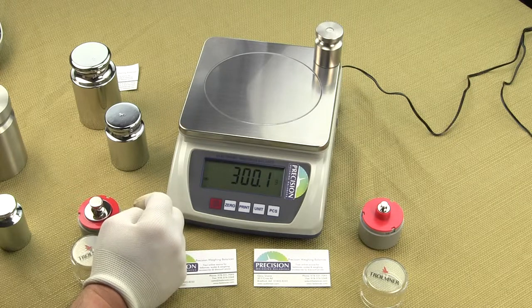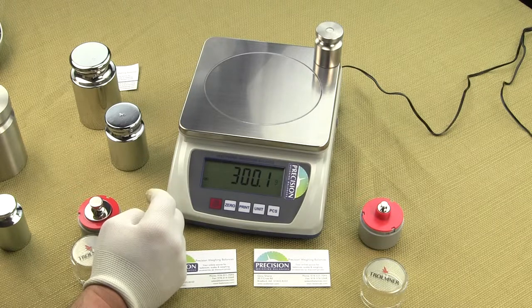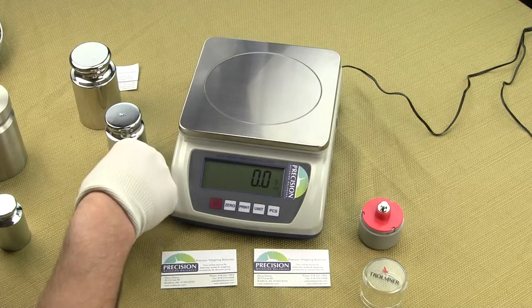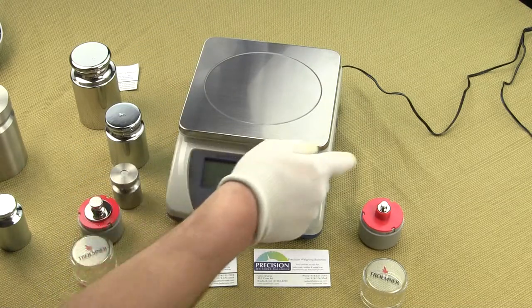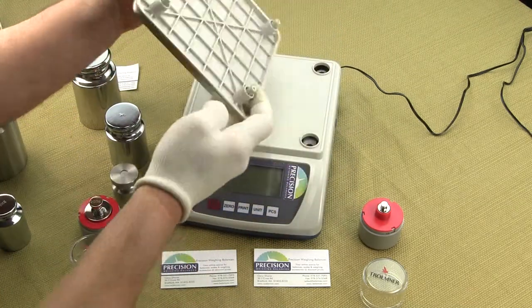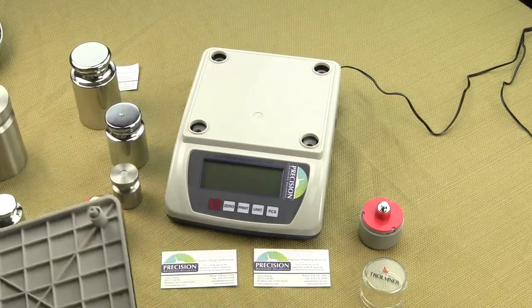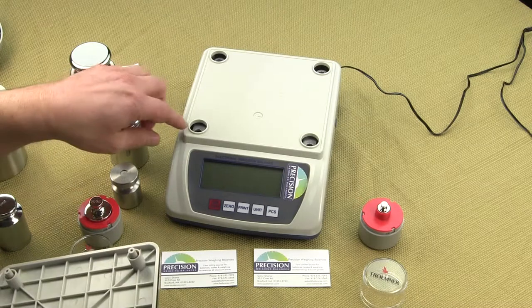The four-post design costs more to manufacture, and this is why many major brands only go with a single post — to cut corners and maximize profit while diminishing your weighing accuracy. When transporting a scale, the ability to remove the weighing platform prevents the load cell from being damaged from excessive loads.